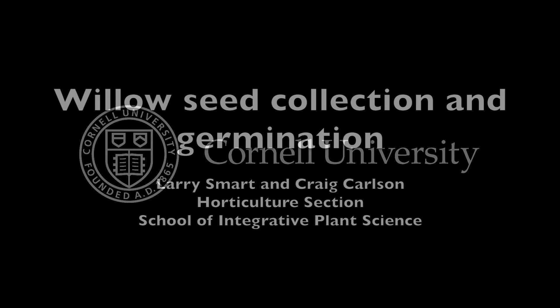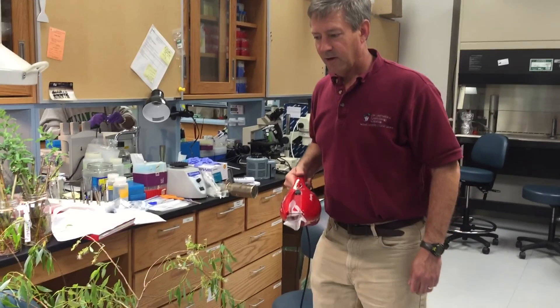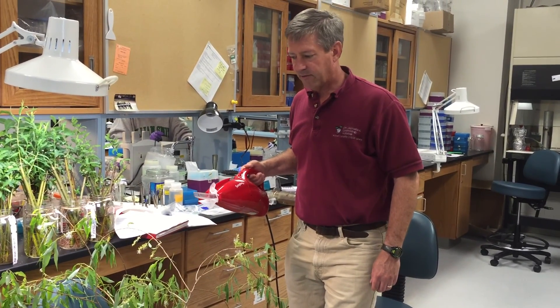This is a production of Cornell University. This is a quick demonstration of collecting seeds from a shoot of Salix nigra collected from the wild.